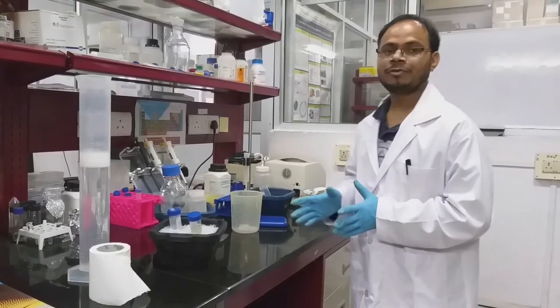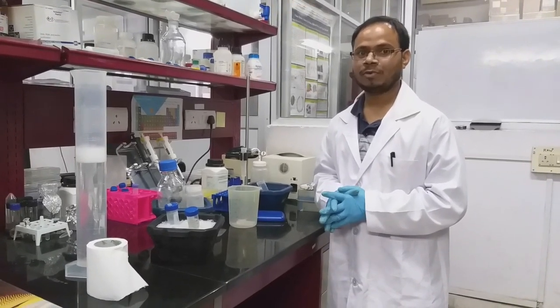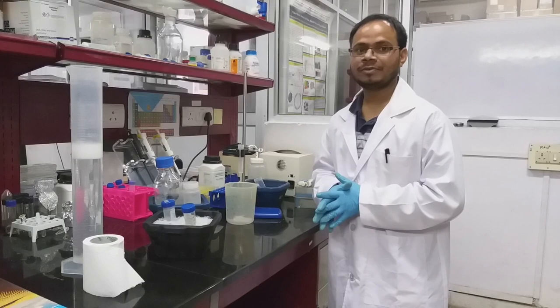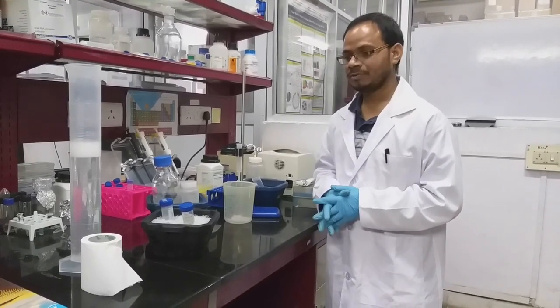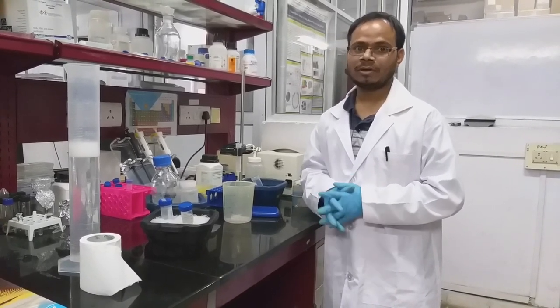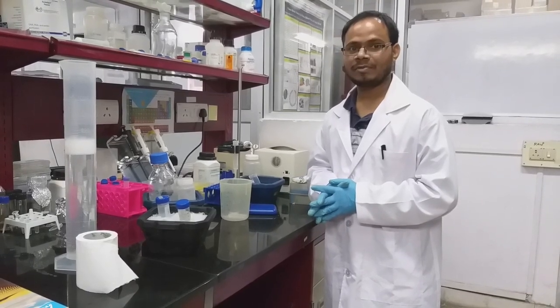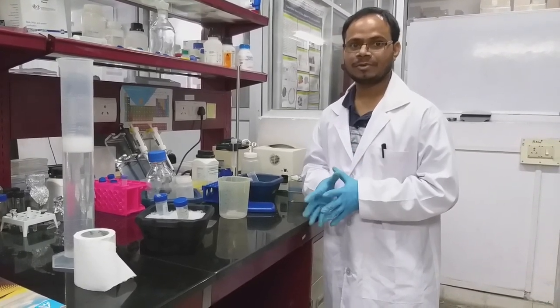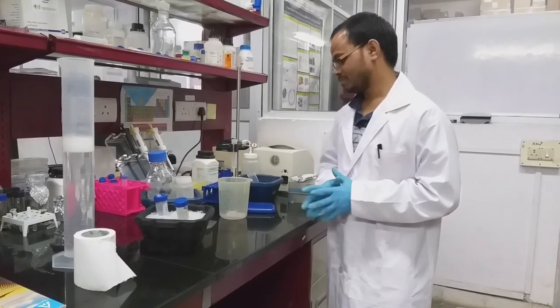So we washed with the equilibration buffer and we also collected the flow through. Now it's time we will wash with 20 millimolar imidazole. So this will remove any non-specific proteins binding to the beads. So we will wash with the 20 millimolar imidazole containing buffer, then subsequently elute with 250 millimolar imidazole containing buffer.